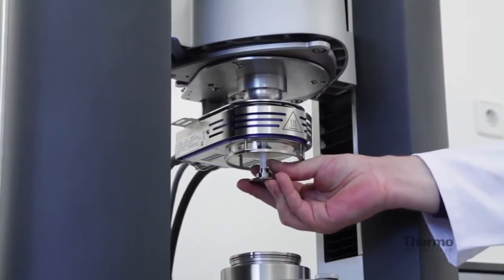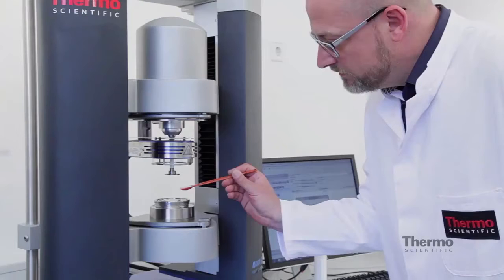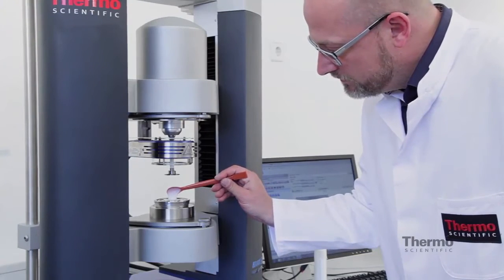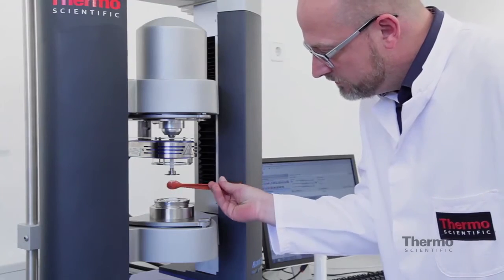The new auto-recognition rotors offer a quick fit functionality. Now all you need to do is to place the sample onto the lower plate.